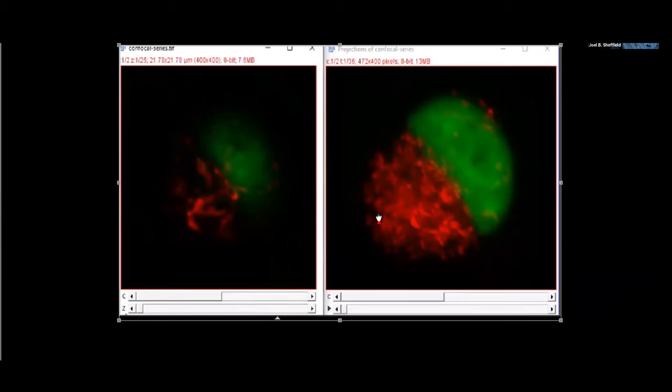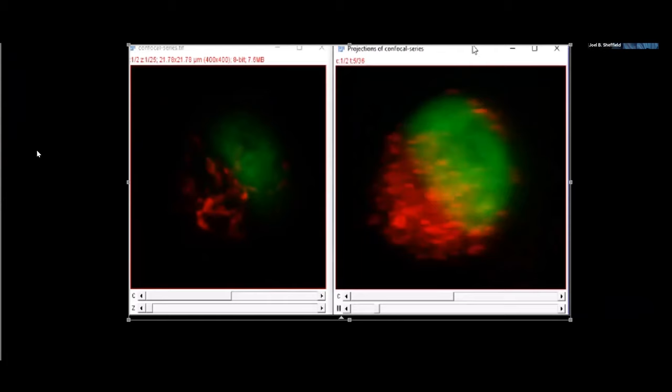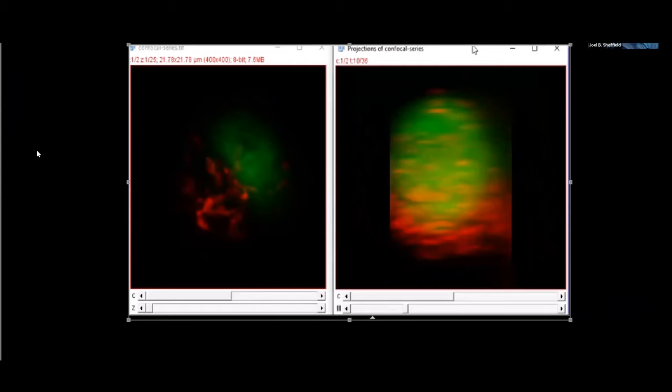Okay, now using the magic of image processing, what's possible is to take those sections and more or less stack them on top of each other and electronically shift their position so it looks like the sample is actually rotating in space. So let's see what happens here. So we've created a kind of three-dimensional model based on a series of slices of that tissue.